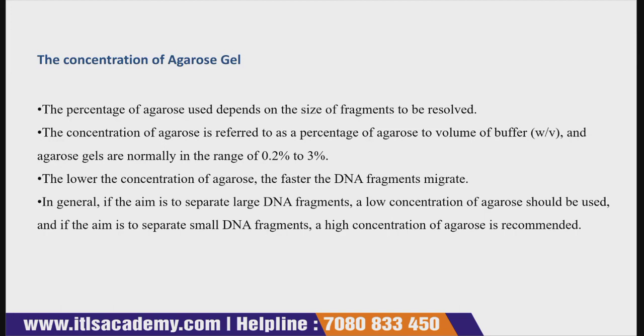Because the lower the concentration of agarose, the faster the DNA migrates. So when you want to separate a large DNA fragment, use a low concentration, and for a small DNA fragment, always use a high concentration of agarose gel.